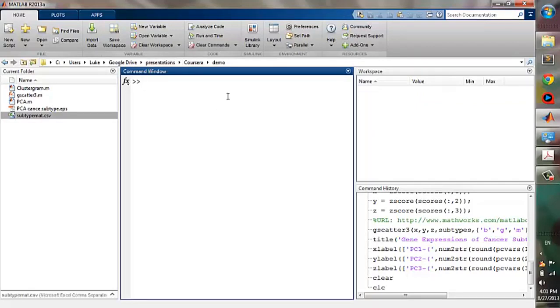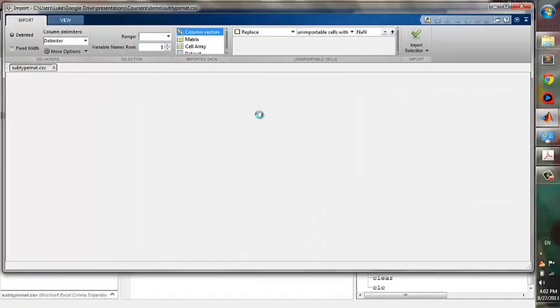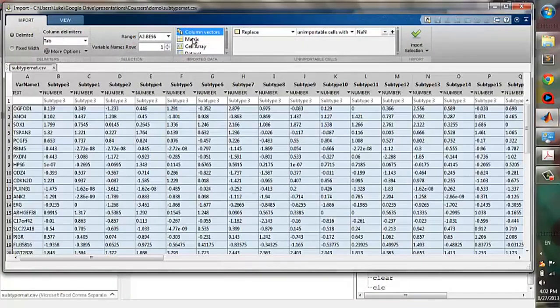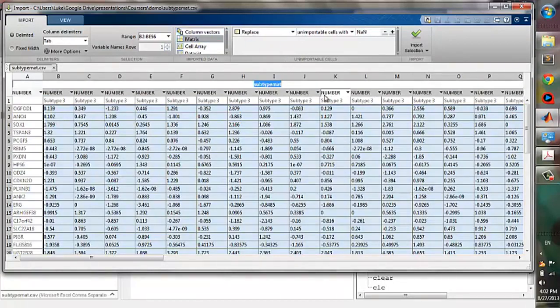First, import the data from a csv file. Click the import data button, select the csv file, and wait for loading. We will import all the numeric values as a matrix and give the name as expressions, and then click import.